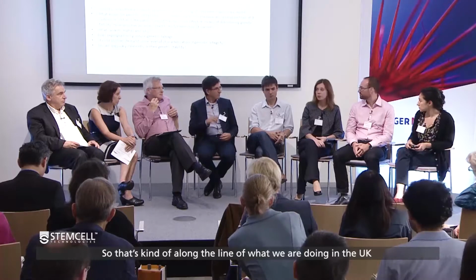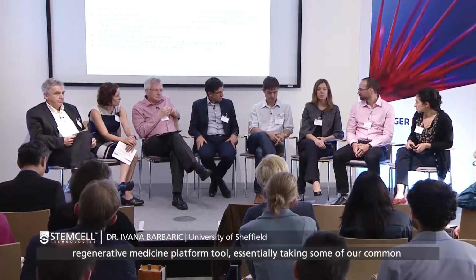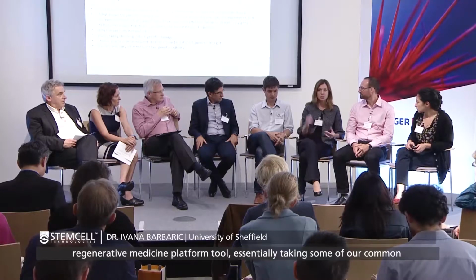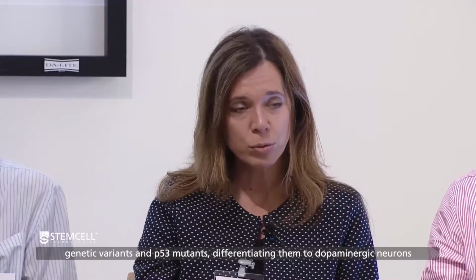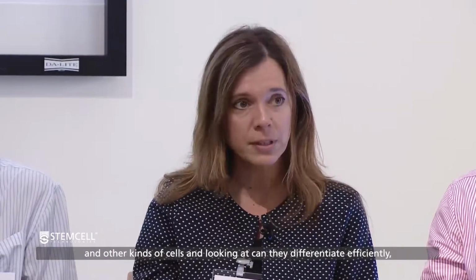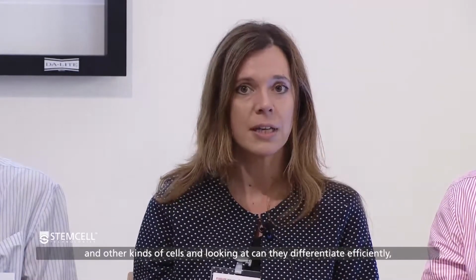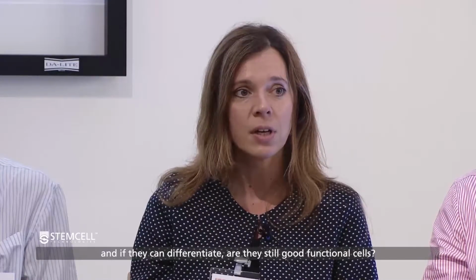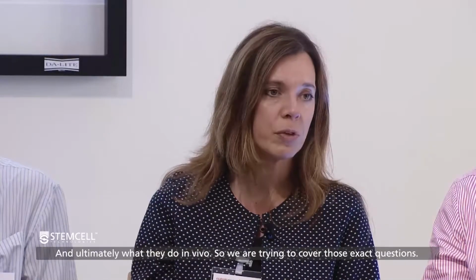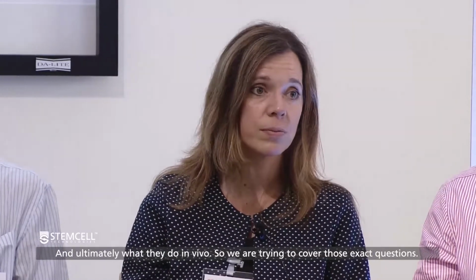And therefore, what in your standards can help us reassure ourselves that that's going to be the case. So that's along the lines of what we're doing in the UK Regenerative Medicine Platform 2, essentially taking some of our common genetic variants and P53 mutants, differentiating them to dopaminergic neurons and some other types of cells, and looking at whether they can differentiate efficiently, and if they differentiate, whether they are still good functional cells, and ultimately what they do in vivo. So we are trying to cover those exact questions.